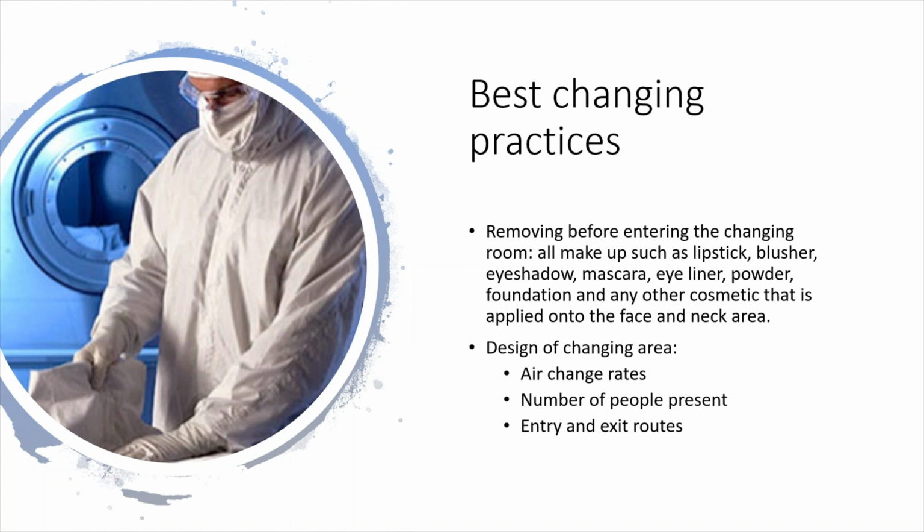So, for example, nail extensions should be removed, hair extensions should be removed. If somebody's had a tattoo recently, you need to make sure that that tattoo is not weeping in any form. So there's various factors to consider as part of this process. You should make sure that the changing area itself is appropriately designed.